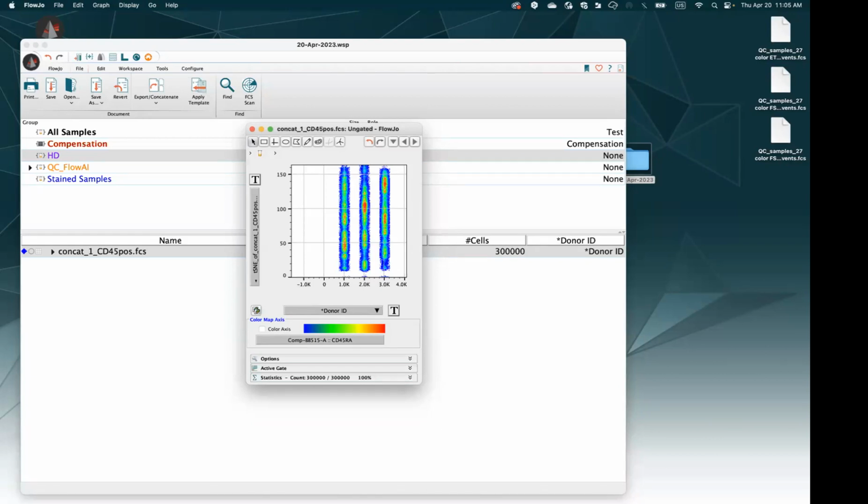Basically, you will remove any population that you don't want to see on your tSNE or on your clusters. Yeah, so if you would want to see only your CD3 positive cells, then you reach it till your CD3s and just focus on them. So it's up to you, but normally you would avoid having all of the dead cells, doublets, and so forth. Yeah.